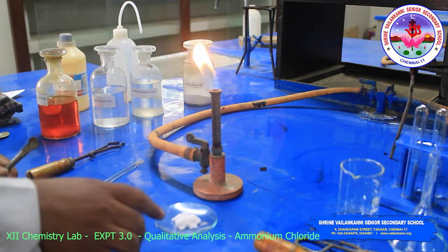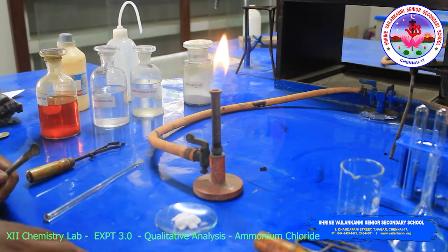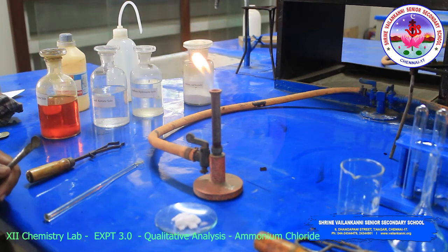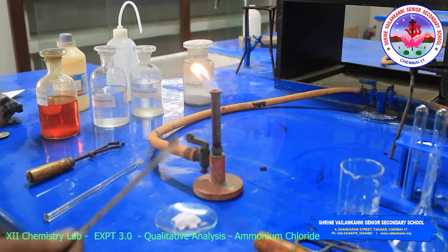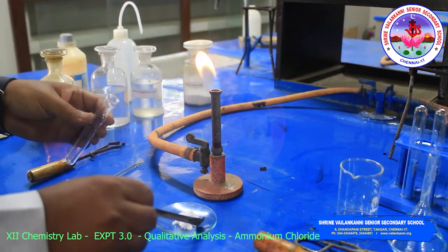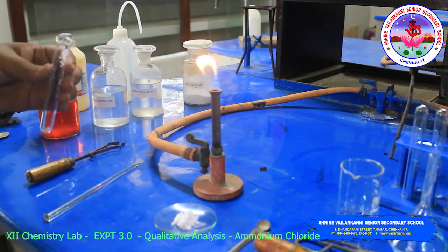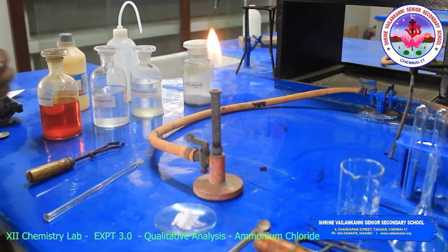First, this is ammonium chloride substance, so we will do the confirmation test. First, you have to wash the apparatus very thoroughly, or otherwise the result will not come. Take a small amount of substance. This is spatula. Take a small amount of the substance. Then a pinch of potassium dichromate is added.